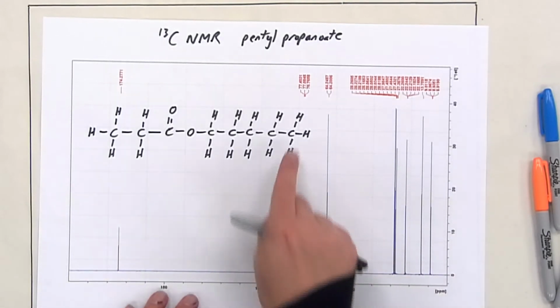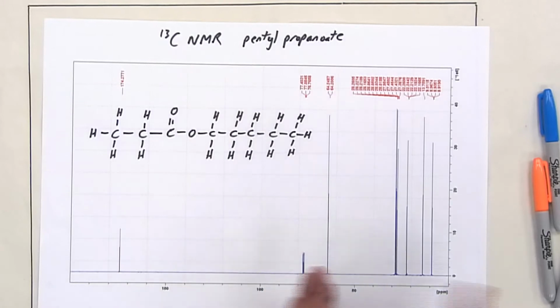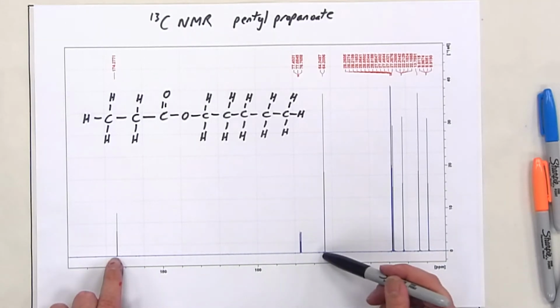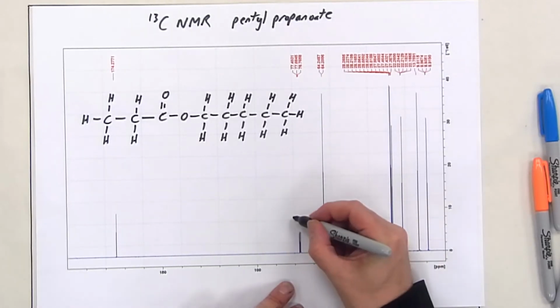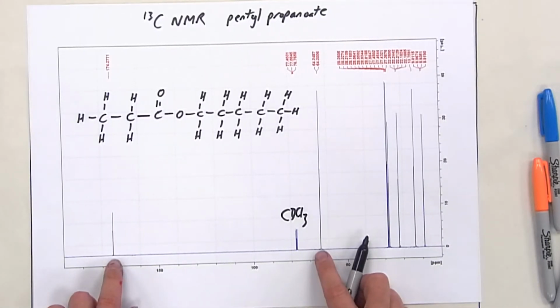The reason for that is they'll be to do with these CH3s and maybe those CH2s, a long way from the oxygen atoms, which are pushing the chemical shift upwards. So we're going to focus on the peaks around 175, so this peak up here, and also this peak around 65. I should also point out that these multiple peaks are again due to the presence of our CDCl3. So we're going to focus on those 2 peaks and look at essentially what they're due to.